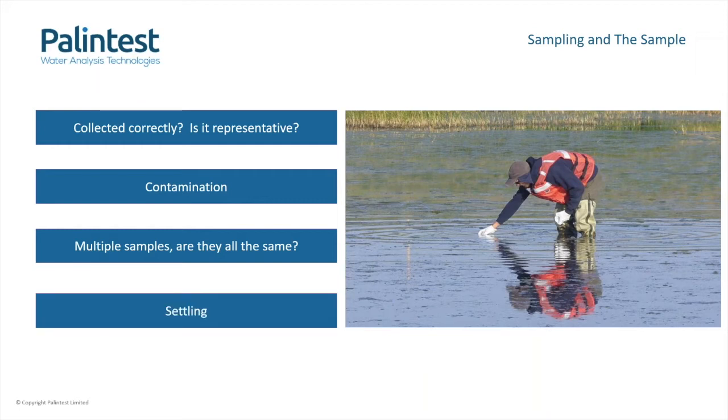If a sample has been stood for a while, could a sediment have settled out? Again, this is common in effluents, and the parameter being tested for, such as a heavy metal, is often in the sediment.